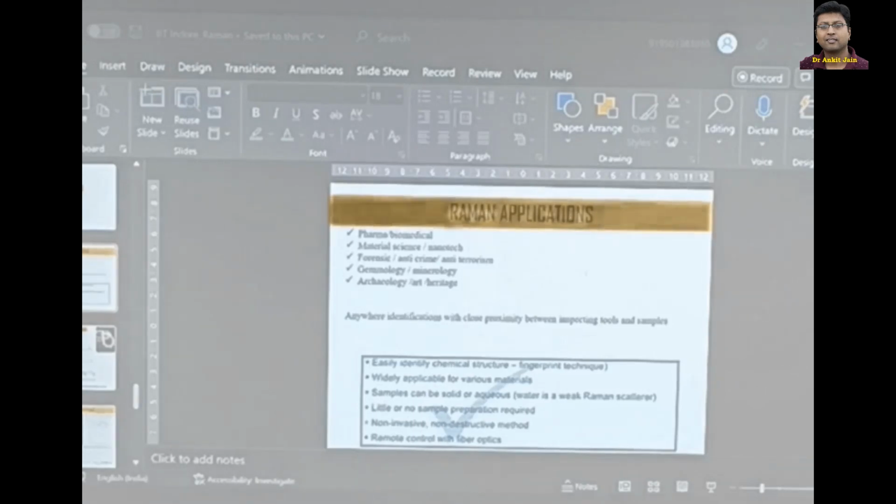There is fluorescent Raman spectroscopy as well as confocal Raman spectroscopy. So if you have proper optics attached to your Raman spectroscope in confocal, then you will be able to focus on the exact area where you want to see Raman. But would it be of interest to you? I am not sure. Cytoplasm Raman or cell network.